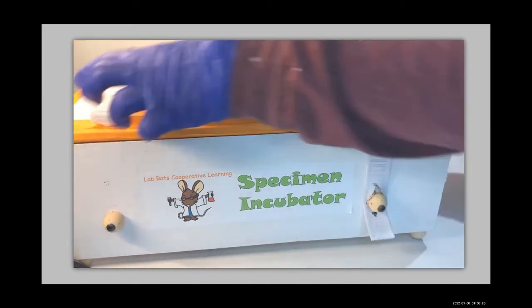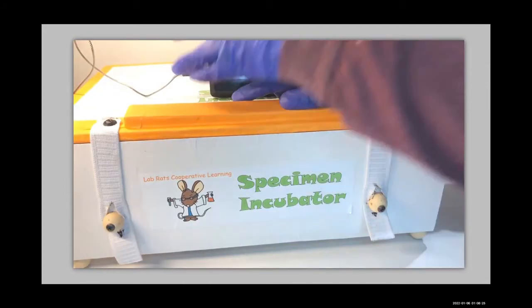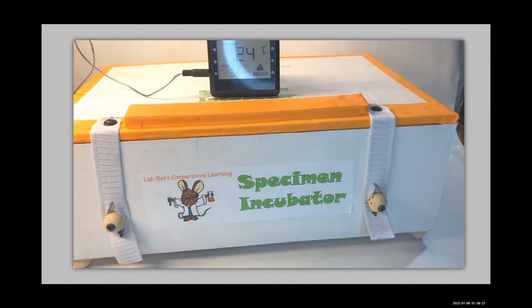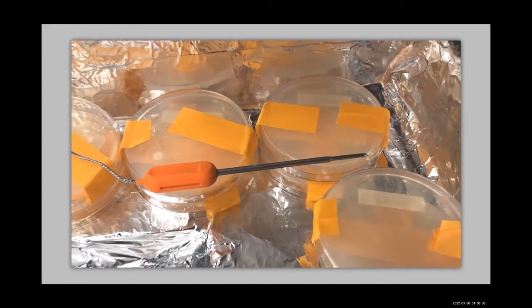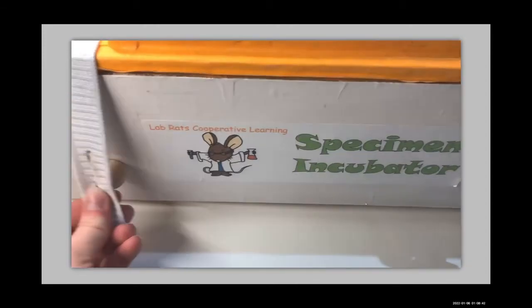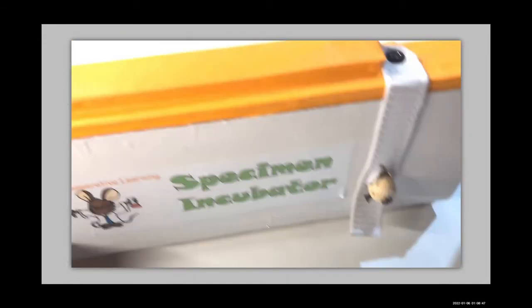Our incubator has a heating pad in the lid, aluminum tape all over the inside, as well as aluminum foil and insulating foam. Here's what everything looked like before we closed up the lid. These straps help hold it down tight and keep the heat inside.